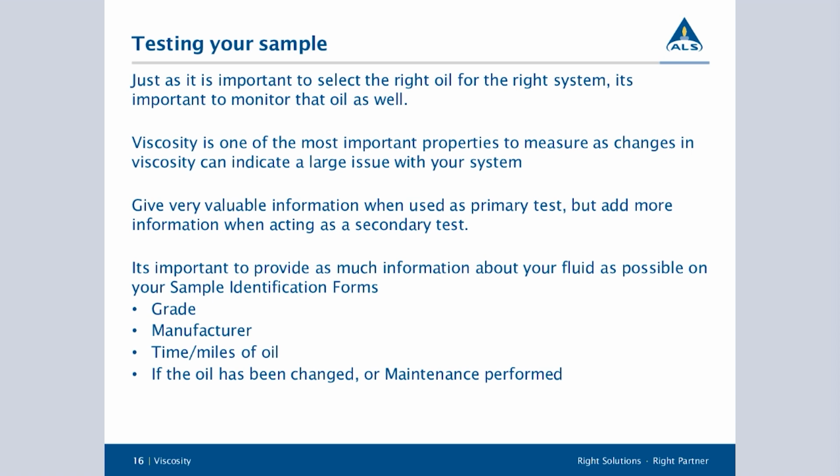It's also important that you're checking your oil at the right temperature. You're picking 40 degrees C for your ISO industrial oils, and then you're looking at 100 degrees C for your SAE engine oils. That doesn't mean that you can't check your SAEs at 40 degrees C, especially if your OEM recommends it or your product data sheet does. Those are acceptable things, and you can always call in and ask us these questions as well to help you out.